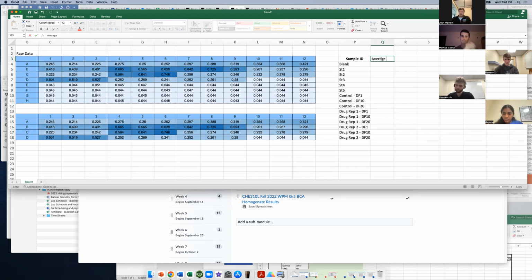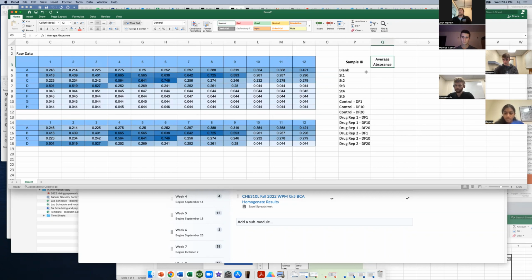Okay. So then we want a column for average absorbance. Average absorbance. I don't want to mess you guys up.